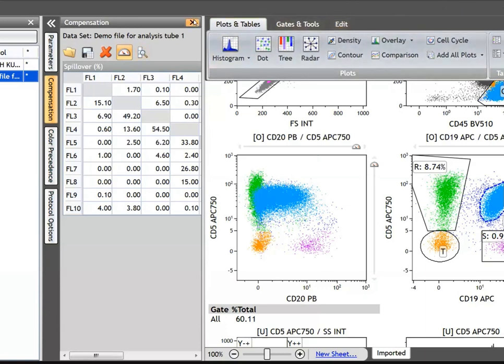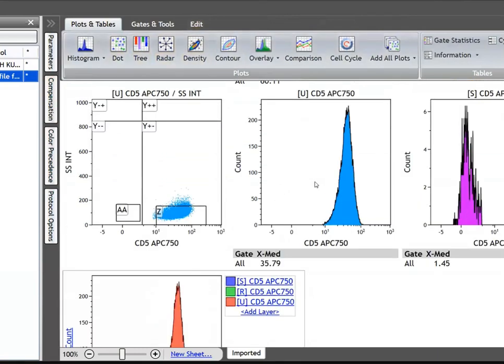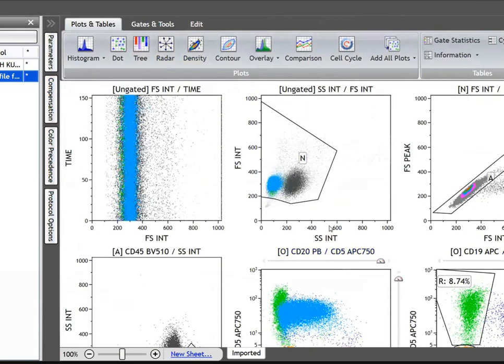These are all software features which are there with the analysis software, which may not be there with your acquisition software. Any other doubts? If you have no doubts, then we can conclude the session.